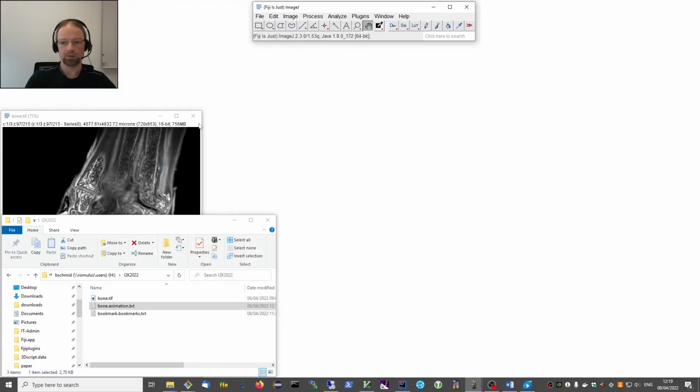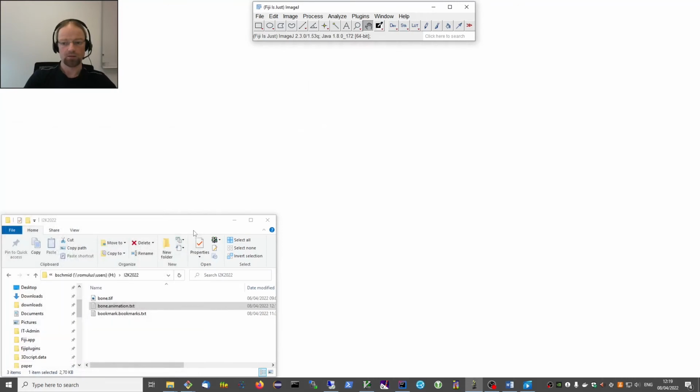So let me close these things here. What we developed is basically a client-server architecture. Everything is still implemented in the Fiji ecosystem. There's a server which does the rendering, implemented as a Fiji plugin, and there's a client which can call the server to do the rendering, and the client is also implemented as a Fiji plugin. The ideal scenario for which this is made is: you imagine you have a lab, with a shared computer which you use for processing and demanding tasks, and you sit at your workspace and want to access this shared computer and do the rendering there.